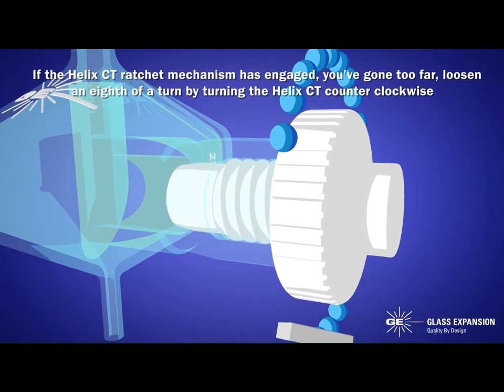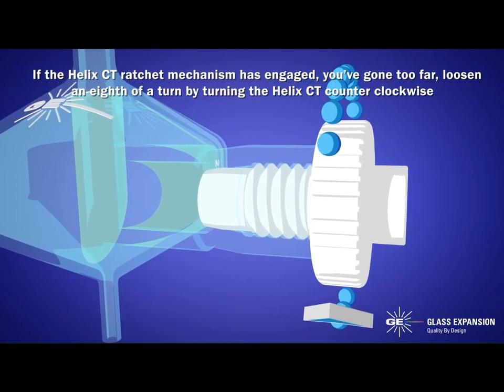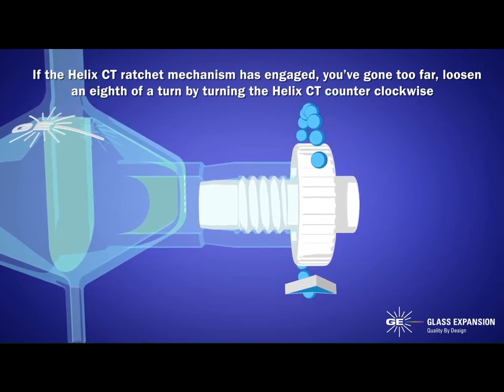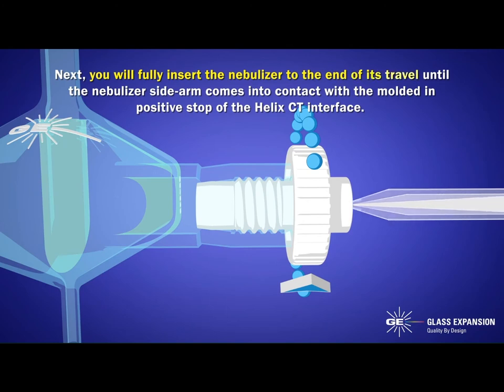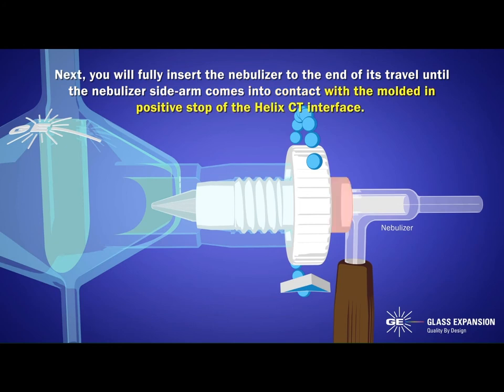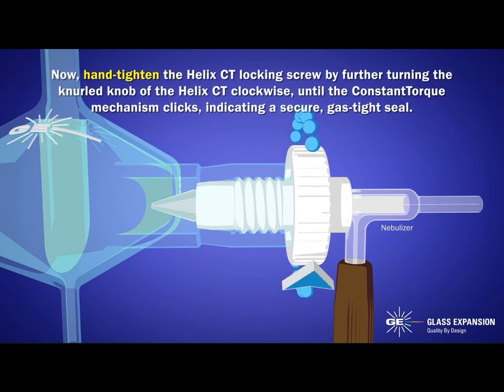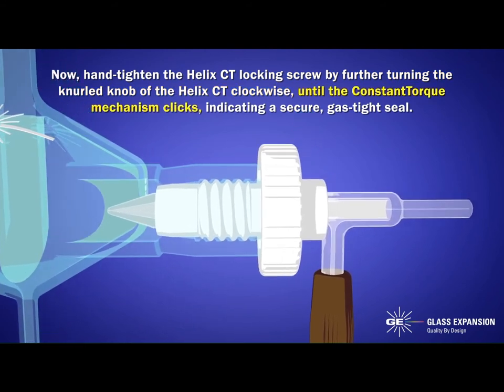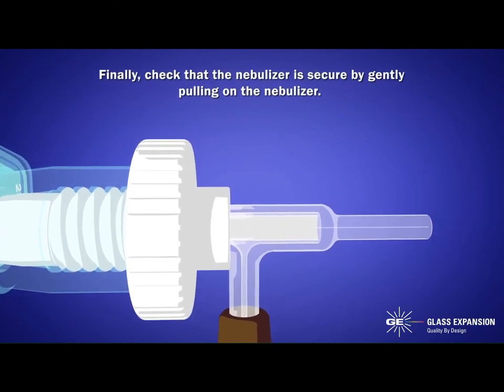If the Helix CT ratchet mechanism has engaged, you've gone too far — loosen an eighth of a turn by turning the Helix CT counterclockwise. Next, fully insert the nebulizer to the end of its travel until the nebulizer sidearm comes into contact with the molded-in positive stop of the Helix CT interface. Now hand-tighten the Helix CT locking screw by further turning the knurled knob clockwise until the constant torque mechanism clicks, indicating a secure, gas-tight seal. Finally, check that the nebulizer is secure by gently pulling on the nebulizer.